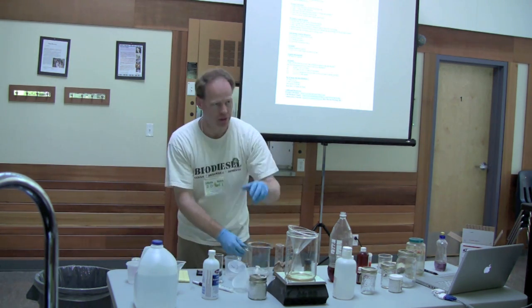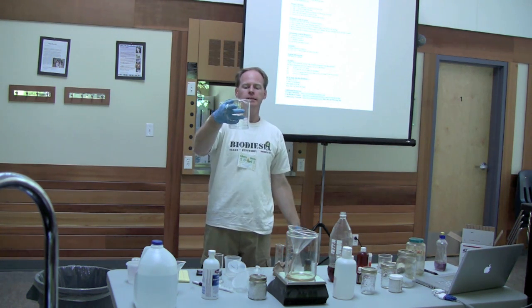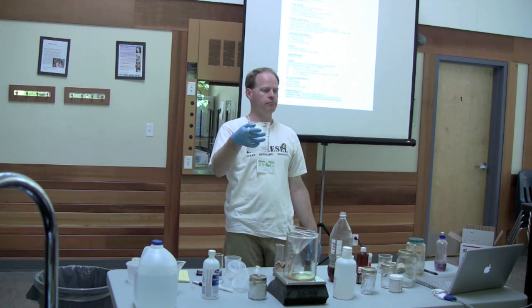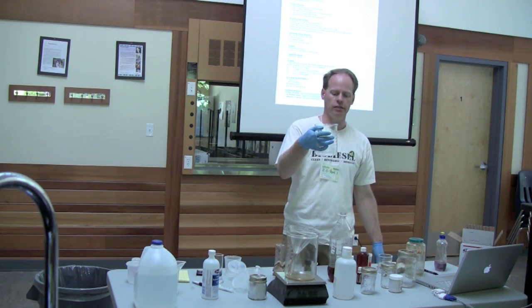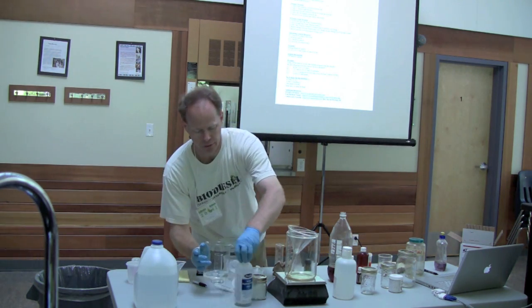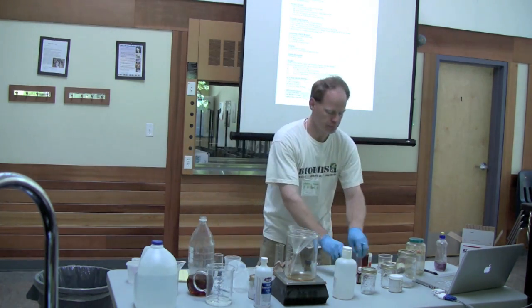You take the methanol and mix it around the potassium hydroxide or sodium hydroxide. This is going to take a little bit to dissolve. If I was using sodium hydroxide, we'd be here a long time. We'd be here tomorrow, well, not quite tomorrow, but it takes a long time. This will take about 5 to 10 minutes and we'll get it all dissolved and then we'll start making biodiesel out of this. While that does that though, we're going to play with some other things. Set that aside while that dissolves.